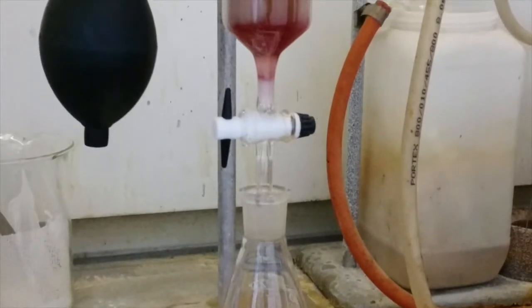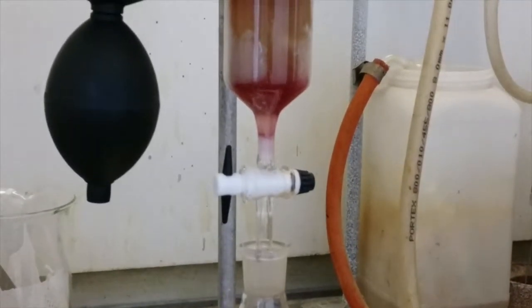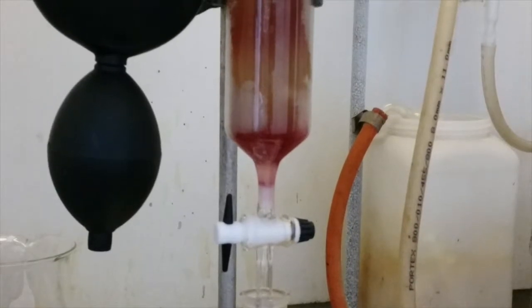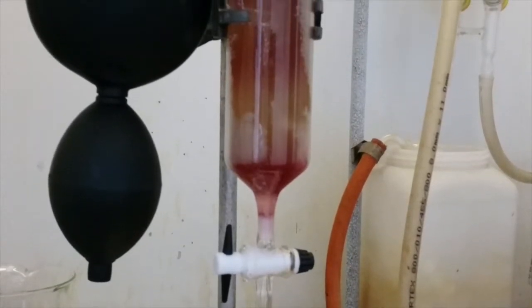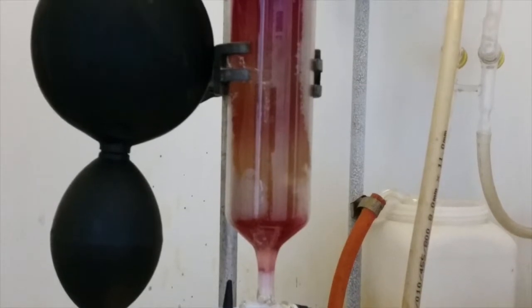You can see the product we were trying to collect is completely eluted from the column. At this point we don't need to add any more solvent and can dry the silica out. It can then be disposed of safely and appropriately at a later date.